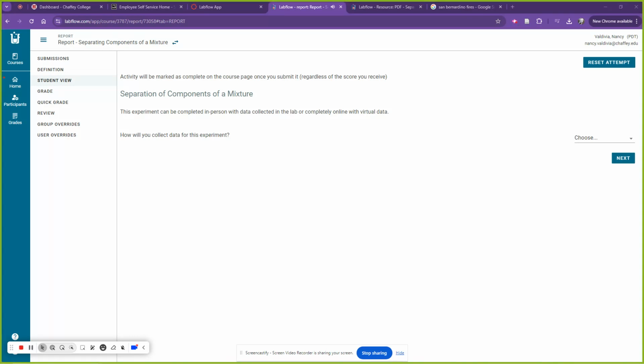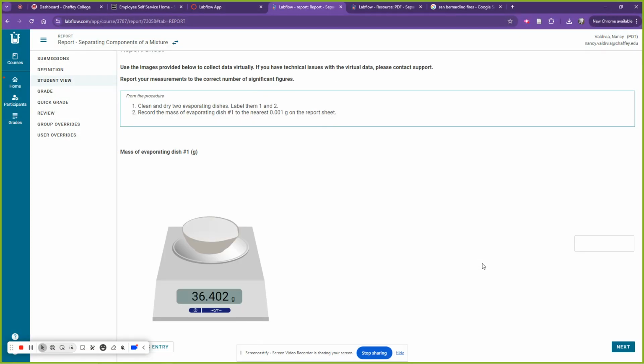Okay, so I'm sharing with you the screen that is going to be recorded. I was just able to open up the lab, just how you're gonna see it. Okay, so first steps first, right?